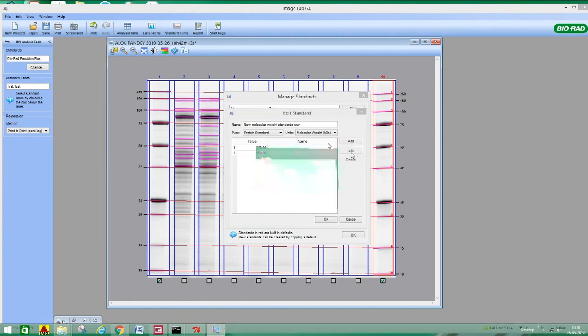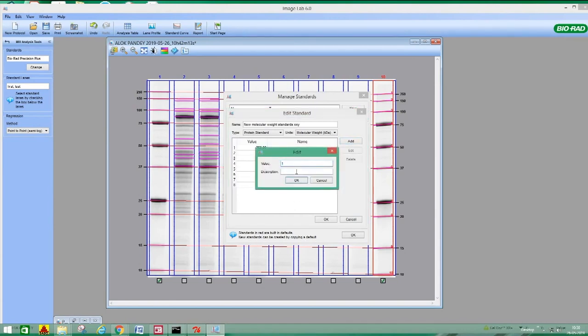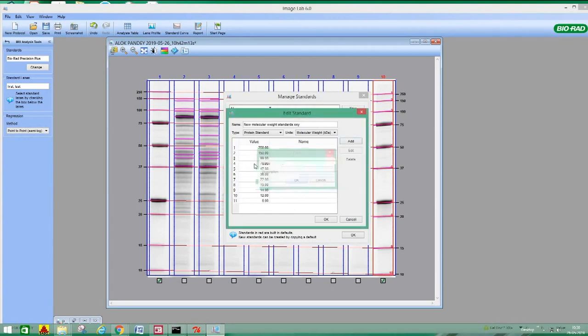The third band is say 99, and the fourth band is 78, and the fifth band is 47, sixth band is 36, seventh band is 22, eighth band is 19, ninth band is 14, this is 12, and the last one you can keep 8. This is just for example purposes only, this is not actually any standard molecular weight marker, just for your understanding I am giving this.